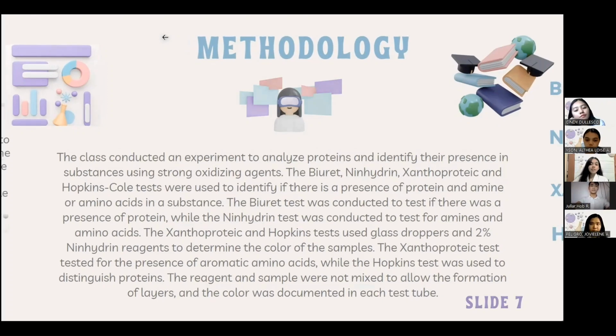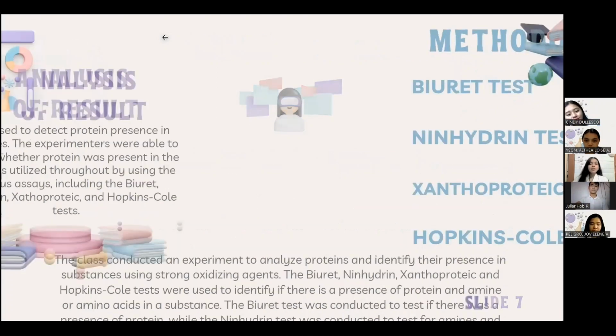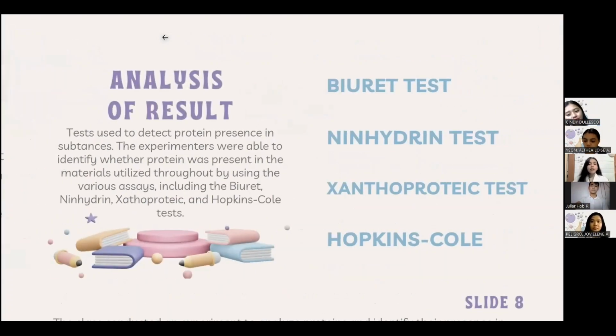Thank you very much, Mr. Jullar. Now let's proceed with the analysis of results. Each test that was performed was able to fulfill its duty in helping the students acknowledge the existence of proteins in each sample that was used. Now let us find out more about these tests on the next slides.